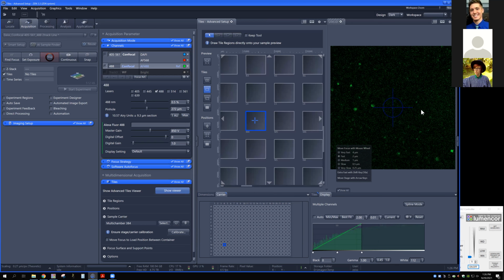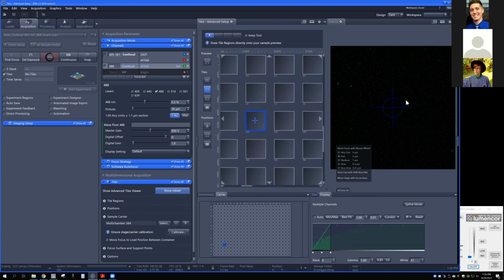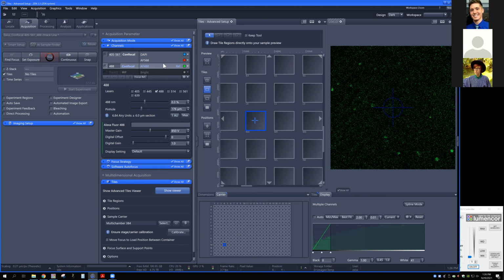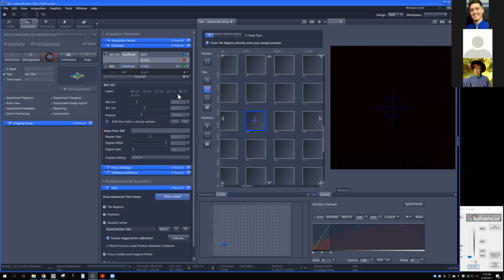It looked like that from the bright field too, but they look like they're really pretty piled up there. Yeah, wow. All right, let's at least work with something that we can see. Let's try red.